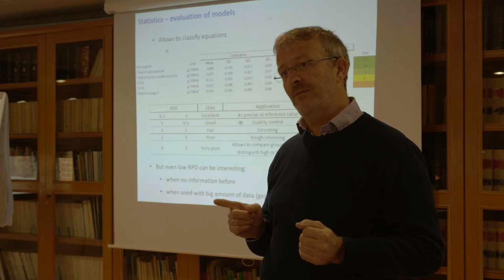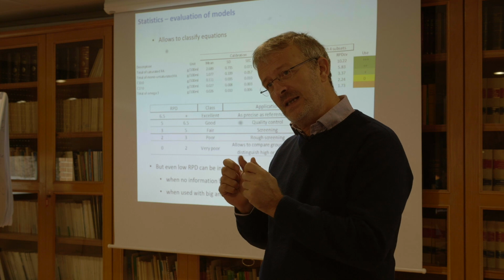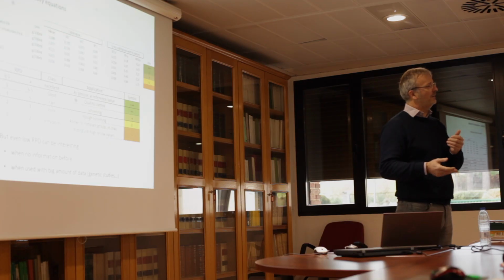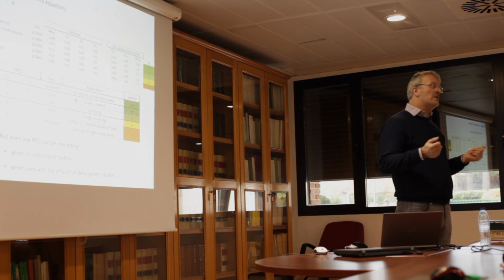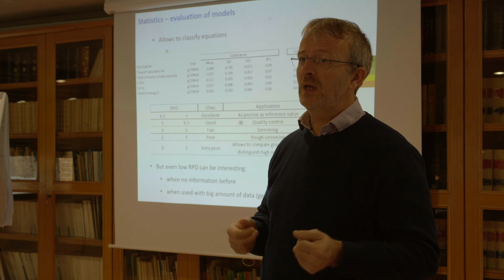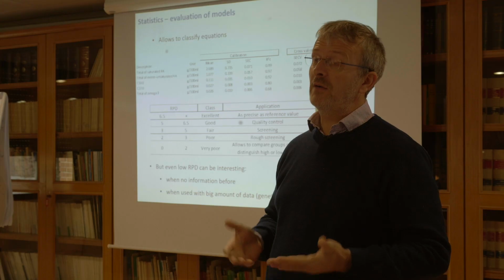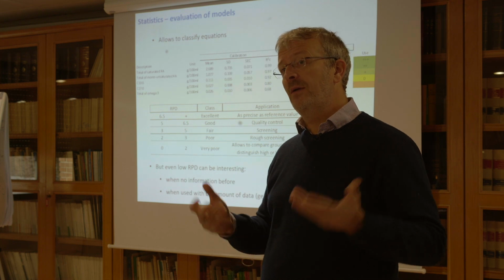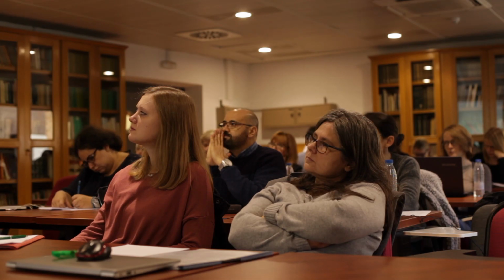But near infrared sometimes could be used for liquid. We use near infrared for the milk sometimes, but the precision of this method is lower than the mid infrared. That's why in routine we use this mid infrared technique in the milking labs and for the payment and so on. And the precision is very much better with the infrared technique.